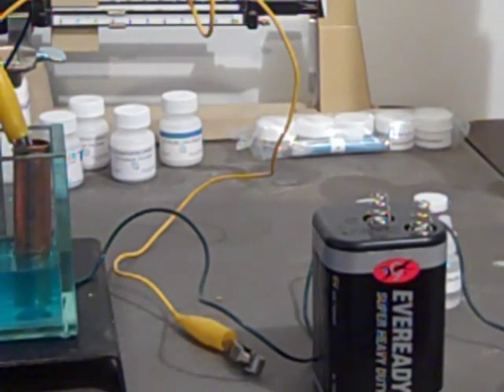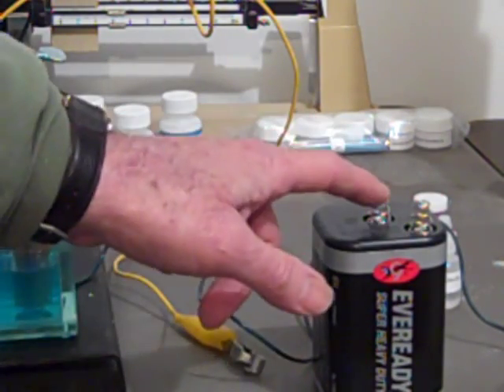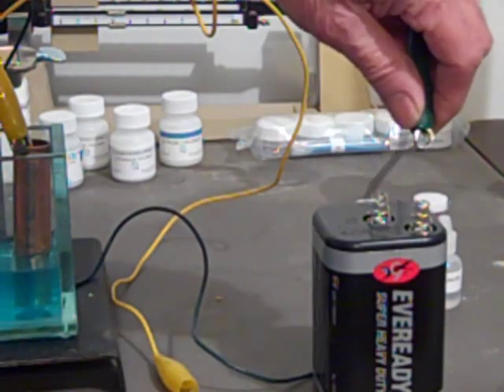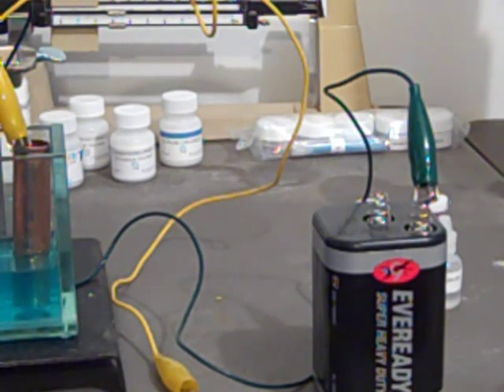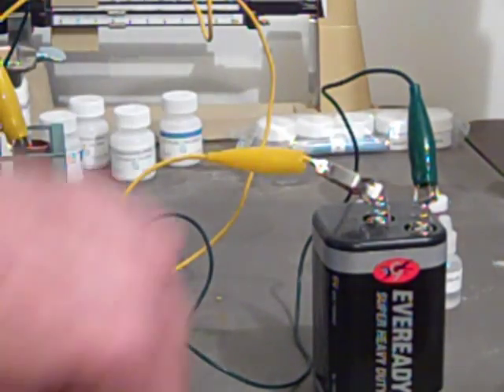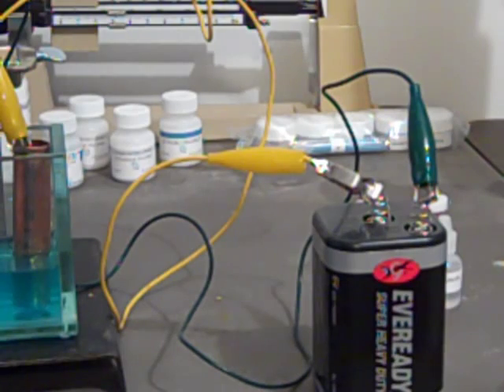Now we have the yellow electrode. I'll show you the battery. This is the negative terminal of the battery, and this is the positive terminal. We'll do what the procedure says: hook up the green alligator lead that goes to the silver to the negative part of the battery. The positive terminal of the battery will be connected to the copper. And we're going to wait five minutes — until it says 7:30 — and see what happens.